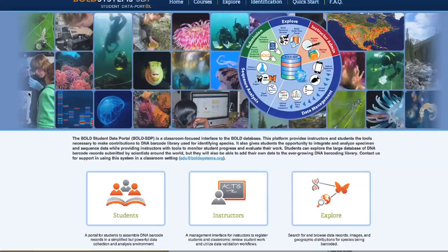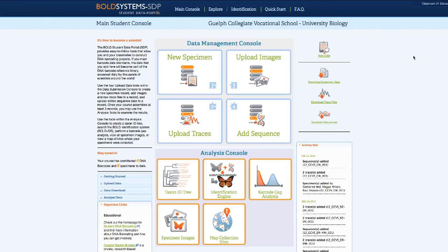To begin submitting data to the Bold Student Data Portal, select Students from the homepage. Once students have signed in with their course username and password, they will be taken to the main student console. This console is designed specifically for students. It is divided into two main sections: data management and data analysis.